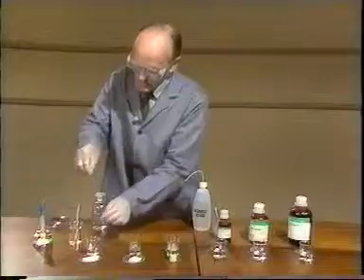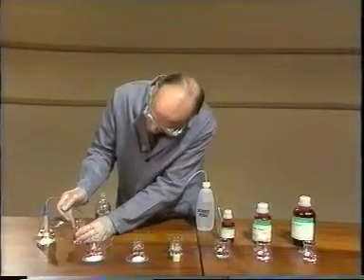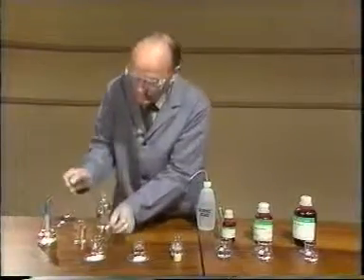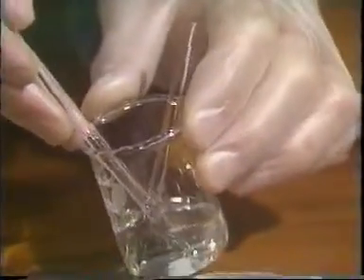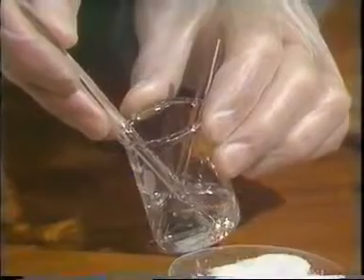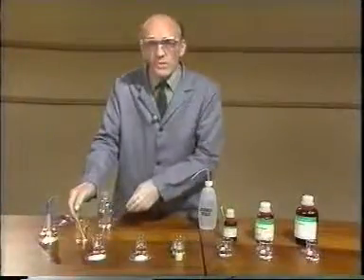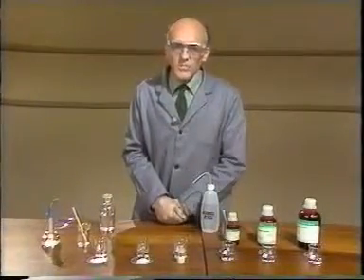But I can check this by looking at the temperature change. The temperature of the water before adding the solid is 22 degrees centigrade, and after mixing it is 21 degrees centigrade. Well, that doesn't represent the sort of change which we normally associate with a chemical reaction.